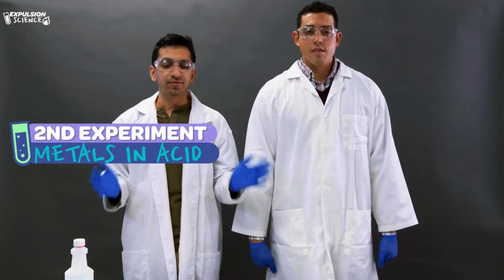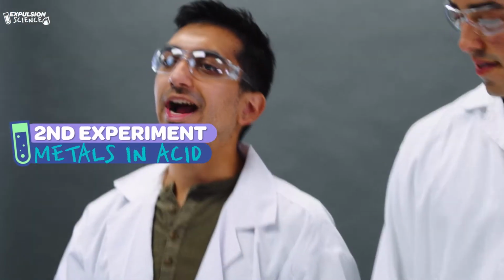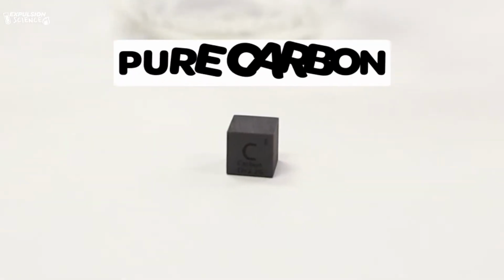Today we're going to be working with 5 different metals, and we're going to be putting them in hydrochloric acid to see how they react. We have zinc, iron, pure carbon, copper, and then we have tin.